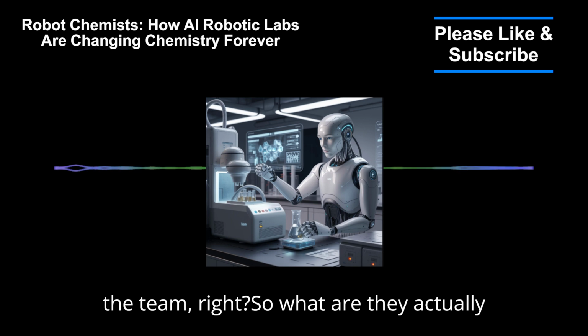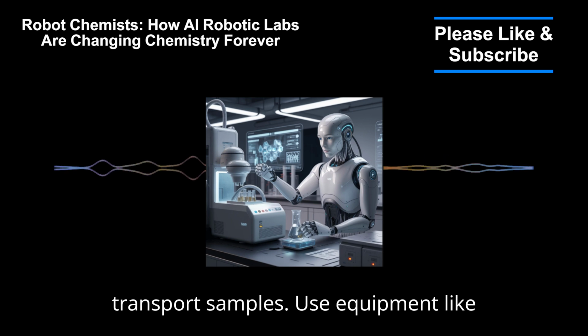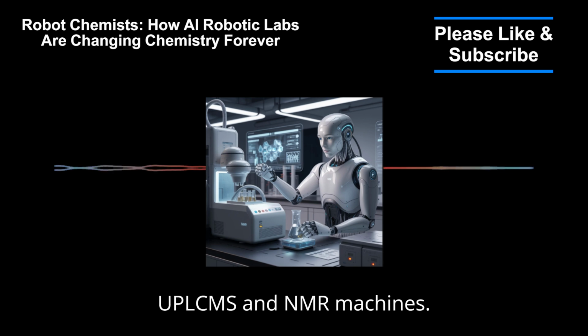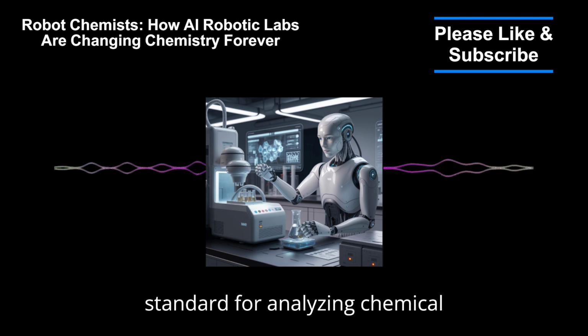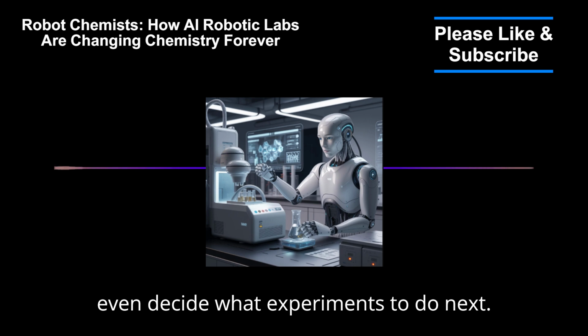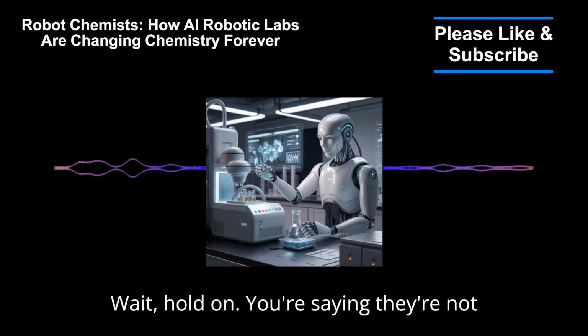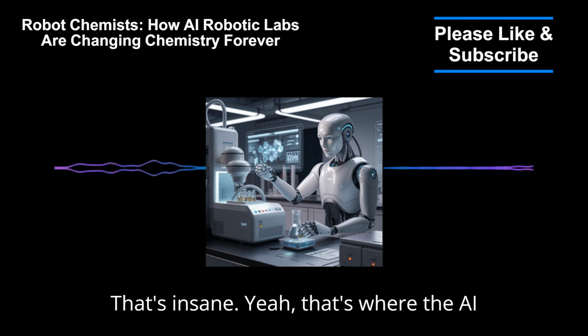So what are they actually doing? Well, they can move around the lab, transport samples, and use equipment like UPLC-MS and NMR machines. Those are the standard for analyzing chemical reactions. And get this, they can even decide what experiments to do next. Wait, you're saying they're not just following instructions, they're making decisions based on data? Exactly. That's where the AI comes in.